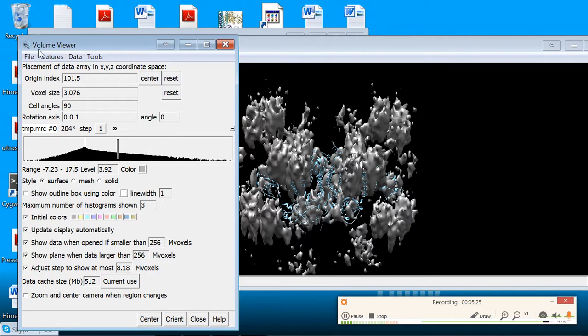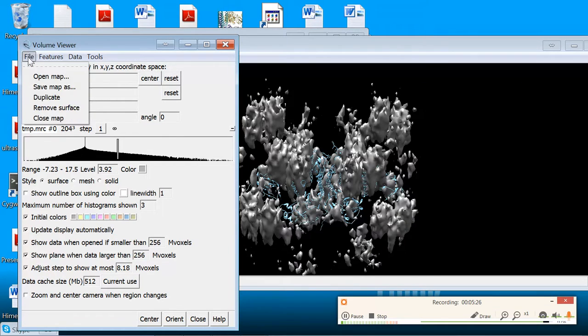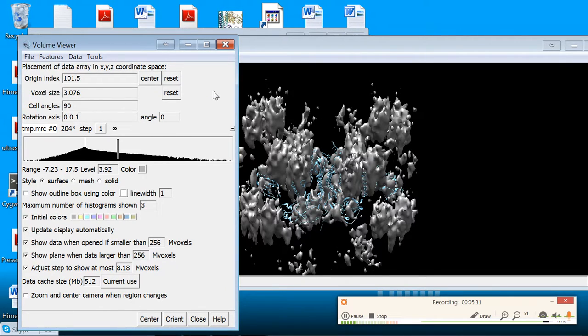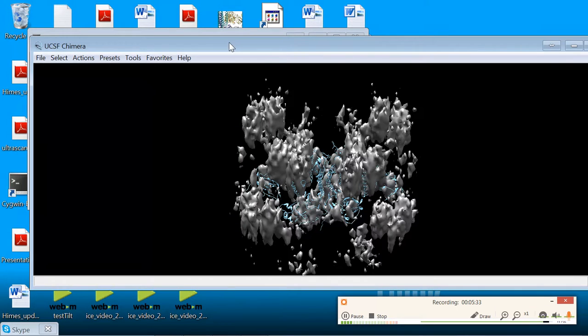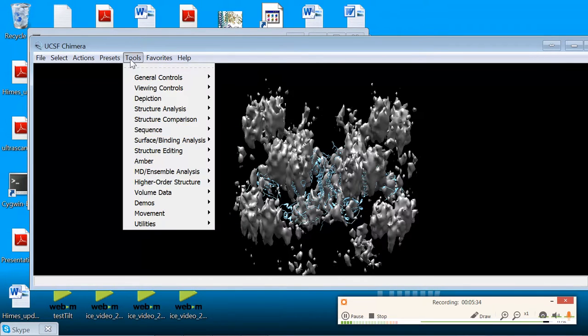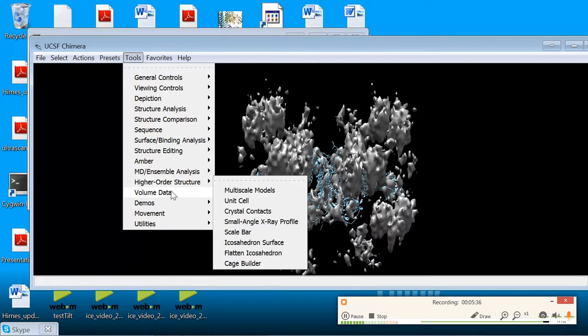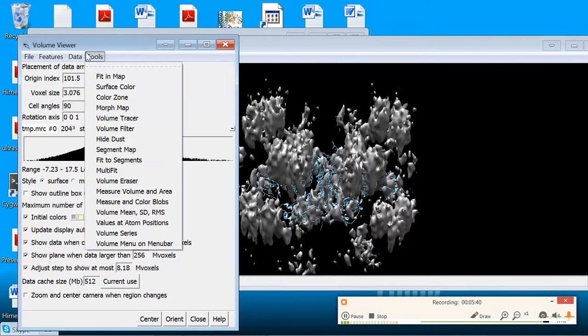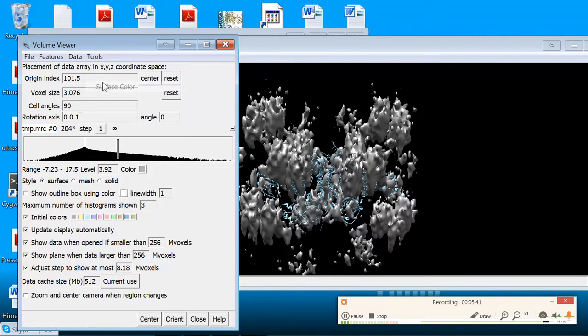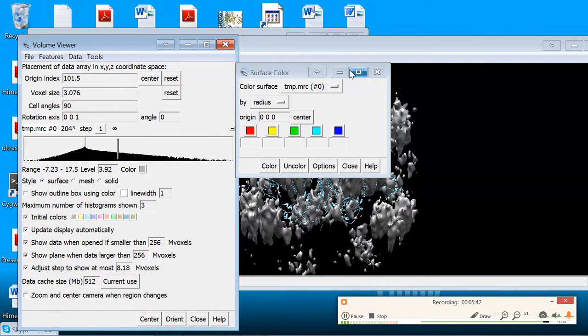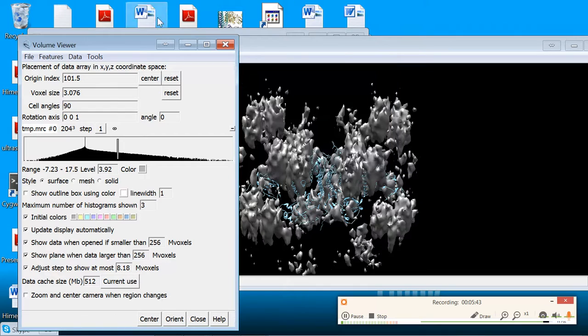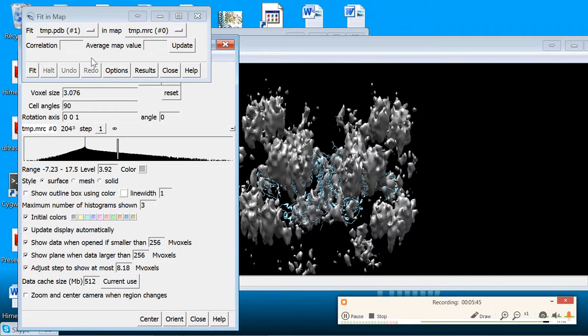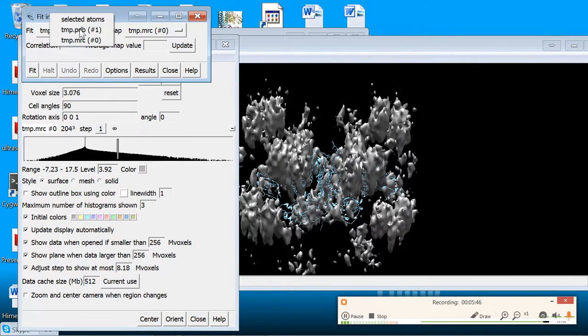After you do that, you'll want to save the map, which you do from the Volume Viewer, Save Map As, and save your map. Once you've saved your map, you use the tool called Fit in Map, which is again under the Volume Data. So it's the Volume Viewer tool. Go to Tools, Fit in Map, and then you select your model, which in this case was our attempt.pdb, it had a prior name, and fit it into your map.